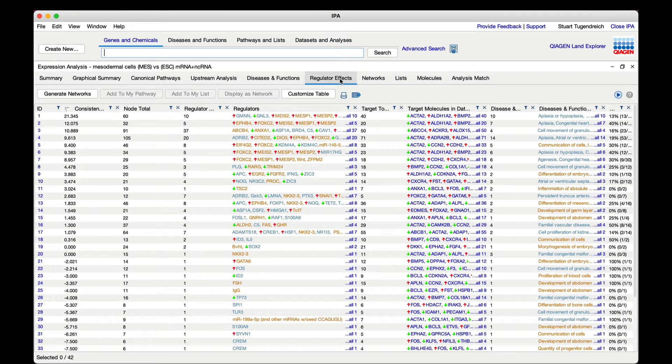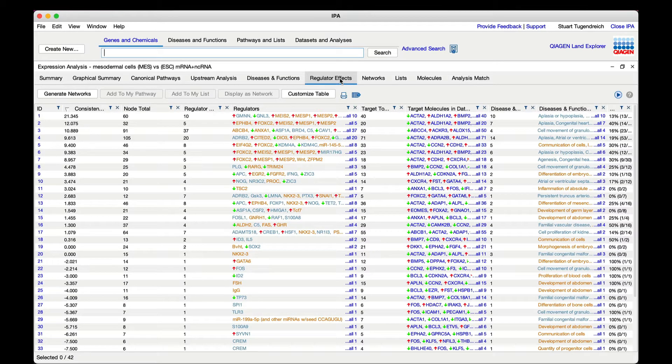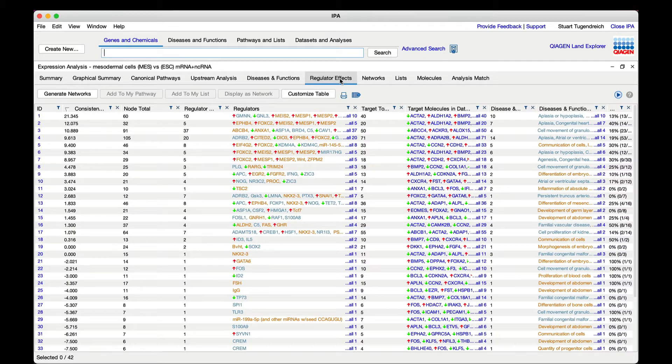IPA can use the expression pattern in your data set to predict drugs or compounds that might either counteract or potentially enhance the downstream effects that are predicted.